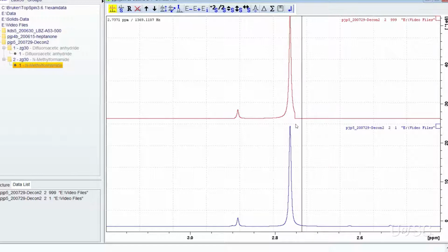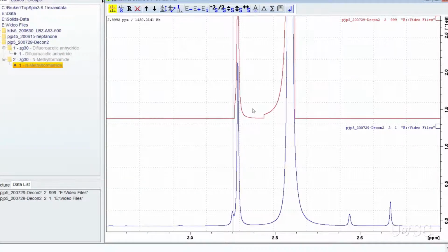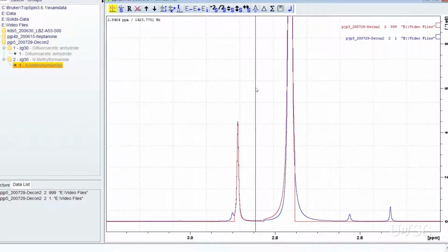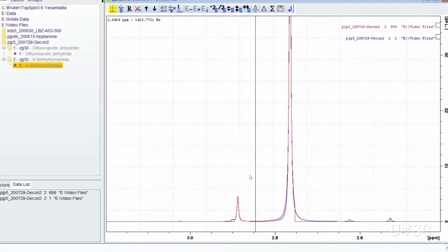The first thing you will notice is that both peaks of the calculated result were truncated at the outside limits. This is a long-lasting and frustrating bug in Topspin. It is unclear if the numeric results are affected by this bug or not. However, the truncated peaks make it difficult to visualize the success of the fit. If we rerun the deconvolution and include peaks outside the area with the two peaks we are interested in, it will push the software bug off the peaks we want to quantify.